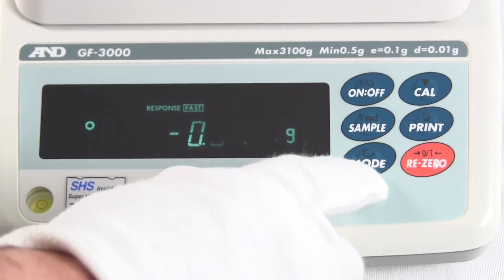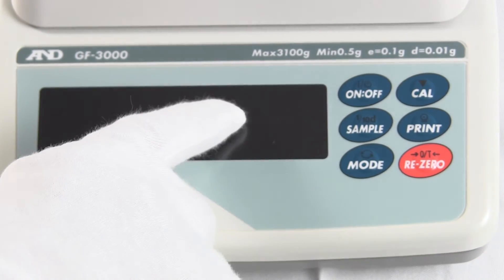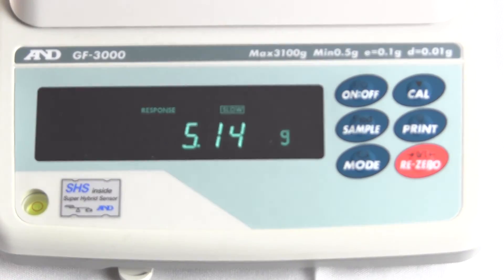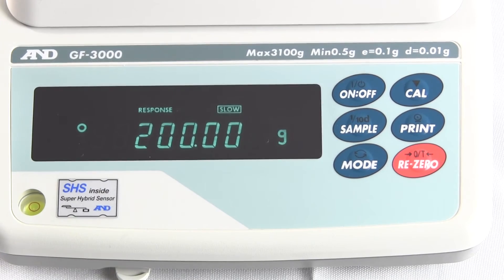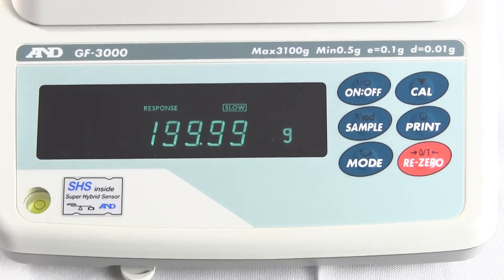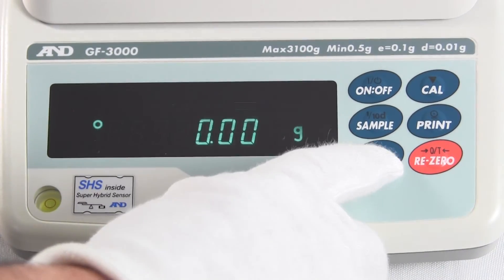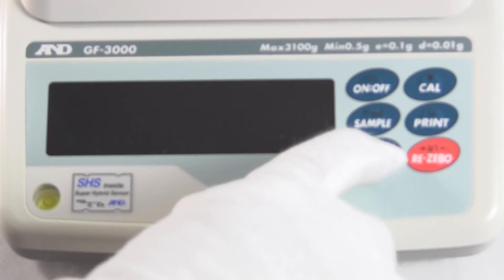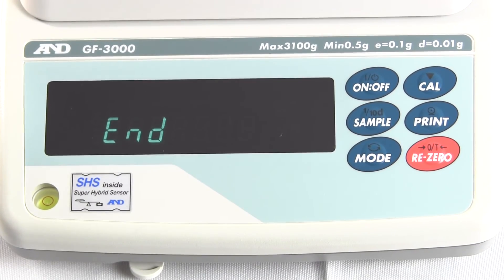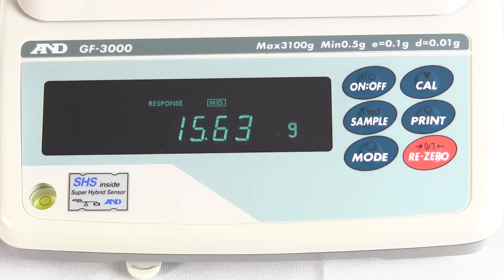If we go into slow mode — hold the Mode button, and when it says 'response' press Mode to select slow. It says End and now the balance is in slow mode. Notice how it's a lot slower. Sometimes you want more stable results and don't want numbers to flicker, especially if you're in an environment with a lot of breezes. To set it back to the default, press and hold Mode until you see response, then press Mode to select medium — the factory default. There you have it. With the 200-gram weight, you'll see the balance responds very nicely.